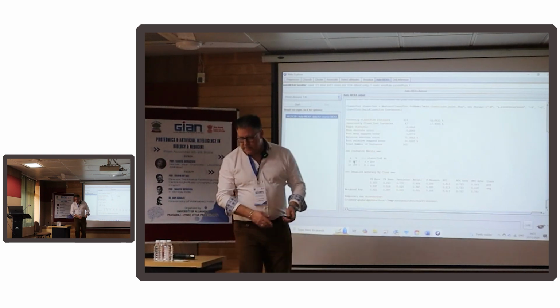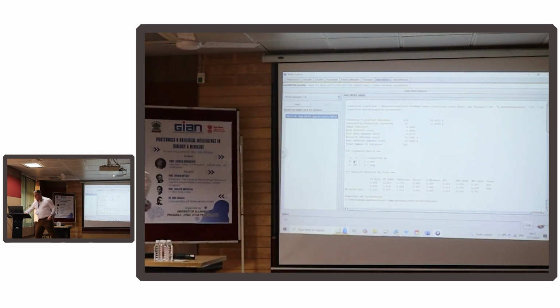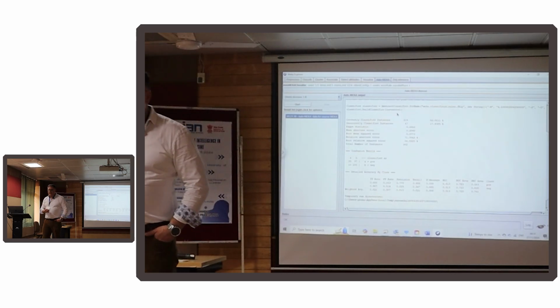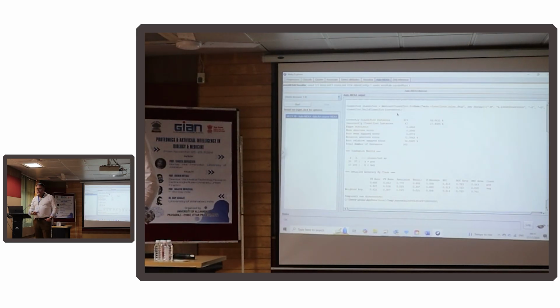Of the positive cases, 35 were predicted as A, and 37 were predicted as B. That immediately tells me my algorithm is not so good at predicting positive cases. It's got more wrong than right for the positive cases.